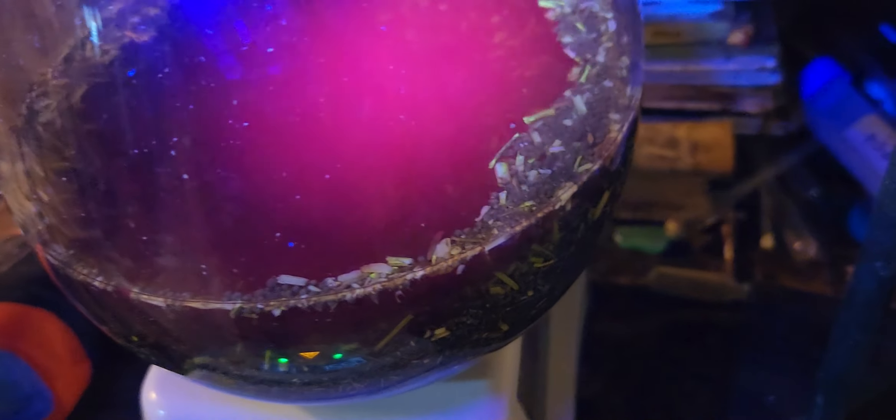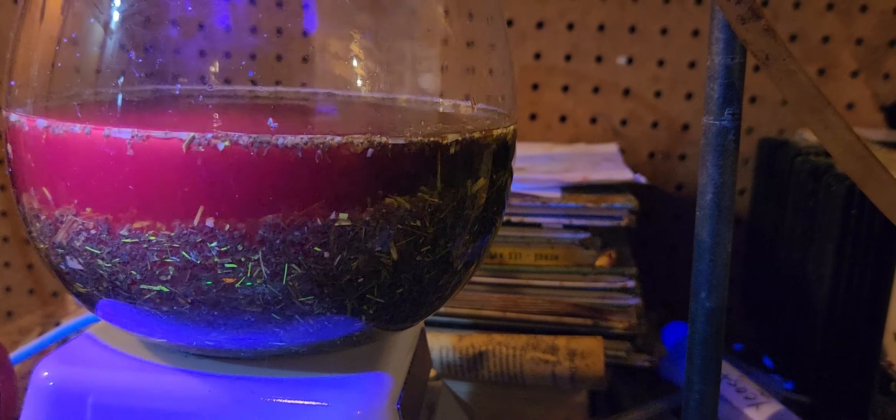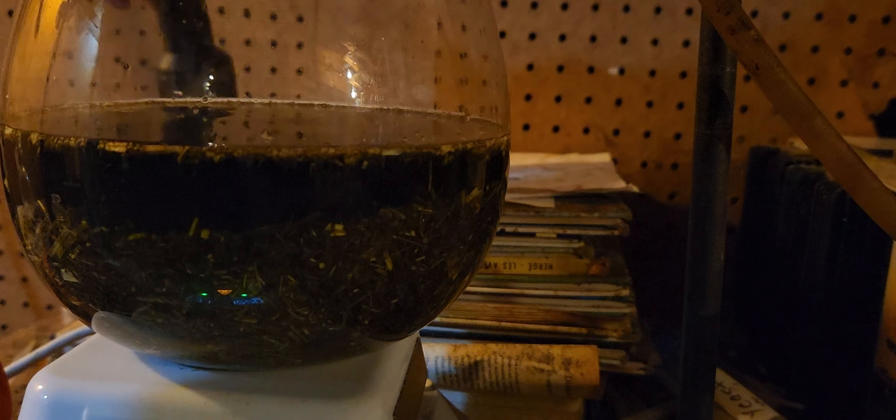Also if we look at it like this, it might be very hard to see, but it's stirring. And what I'm trying to do is to get the chlorophyll removed as well.